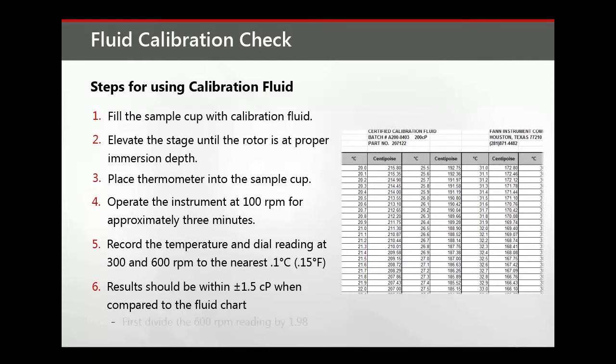Note: it is important to first divide the 600 RPM reading by 1.98 prior to comparing the results to the fluid chart. Readings outside the specified limits are indications that the instrument should be either calibrated or repaired.